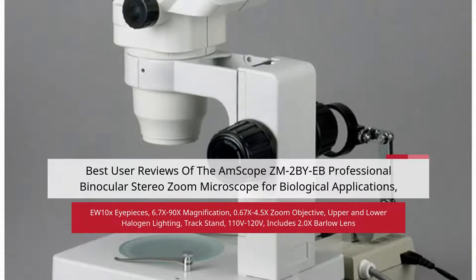Best User Reviews of the Emscope ZM2 by EB Professional Binocular Stereo Zoom Microscope for Biological Applications. Features include EW10X Eyepieces, 6.7x to 90x Magnification, 0.67x to 4.5x Zoom Objective, Upper and Lower Halogen Lighting, Trackstand, 110V to 120V power, and includes a 2.0x Barlow Lens.